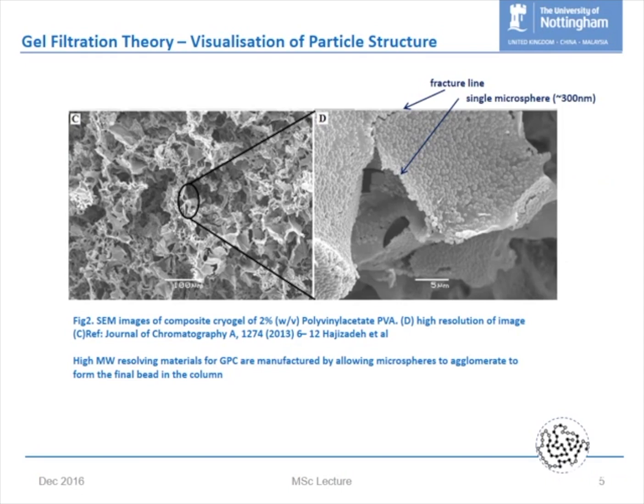Everything I've given you so far has been based on a schematic form, but if you actually did some SEMs of this PVA material, which is what the beads are made of in this instance, then rather than seeing nice schematic pores, which are very clear to understand, we actually see a heterogeneous surface composition. But each one of these effectively starts to behave like a pore. So this is really what we're working with.